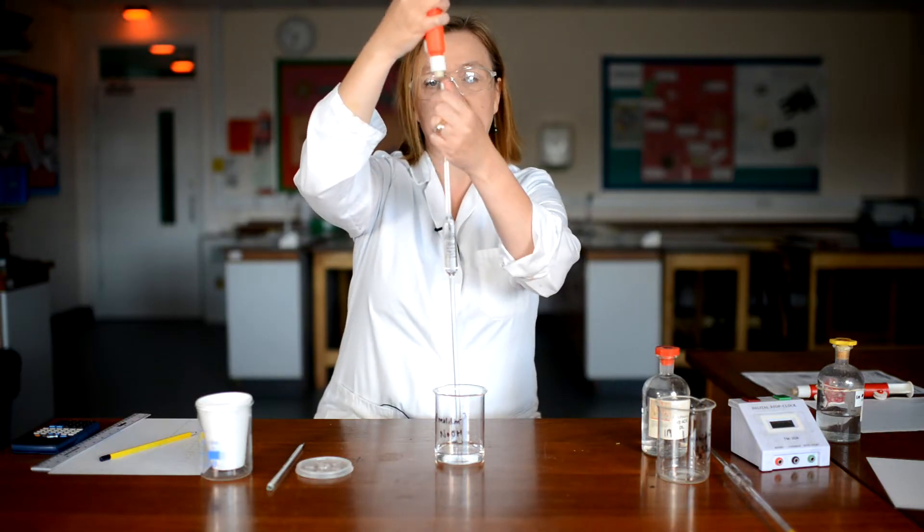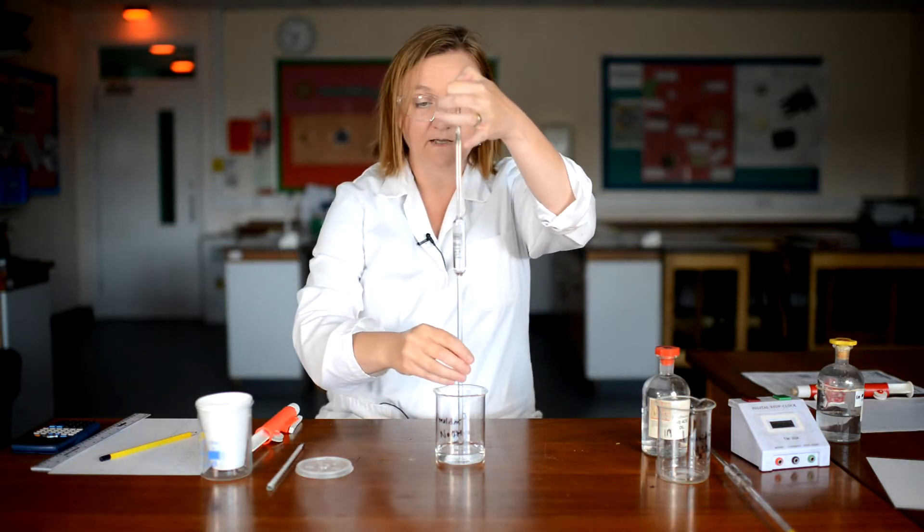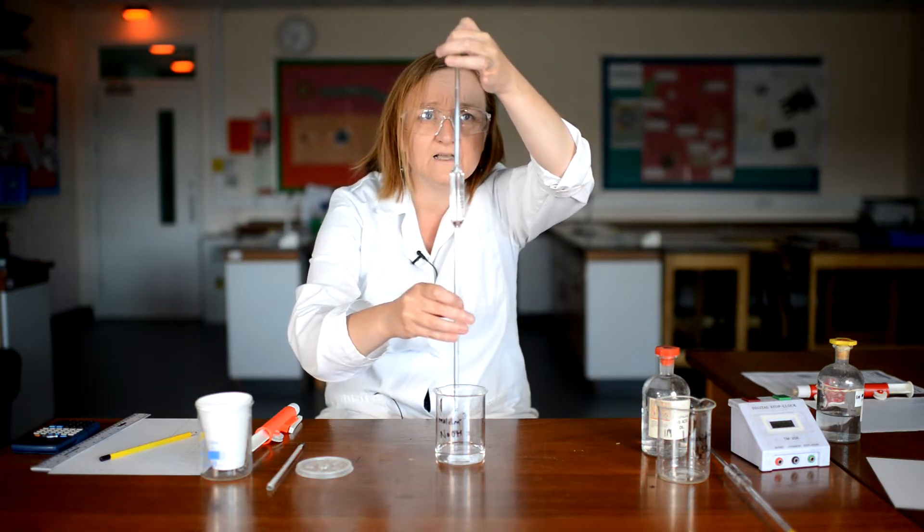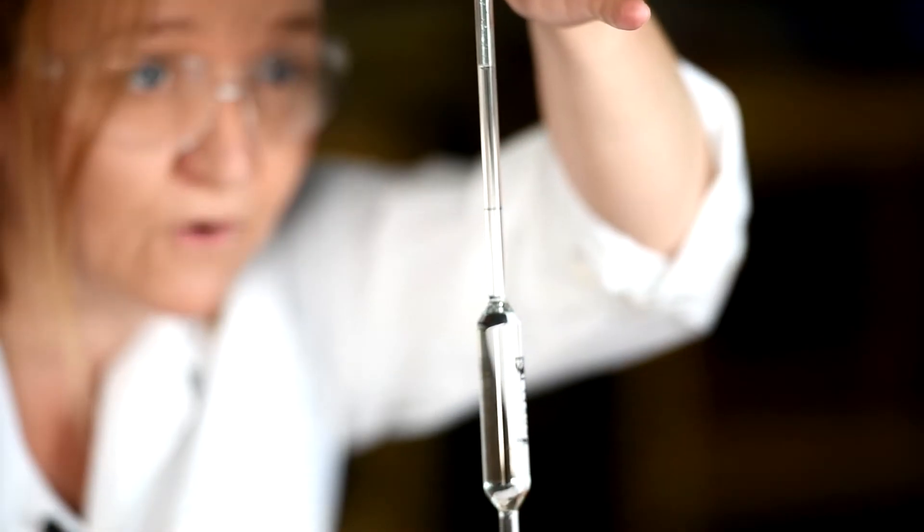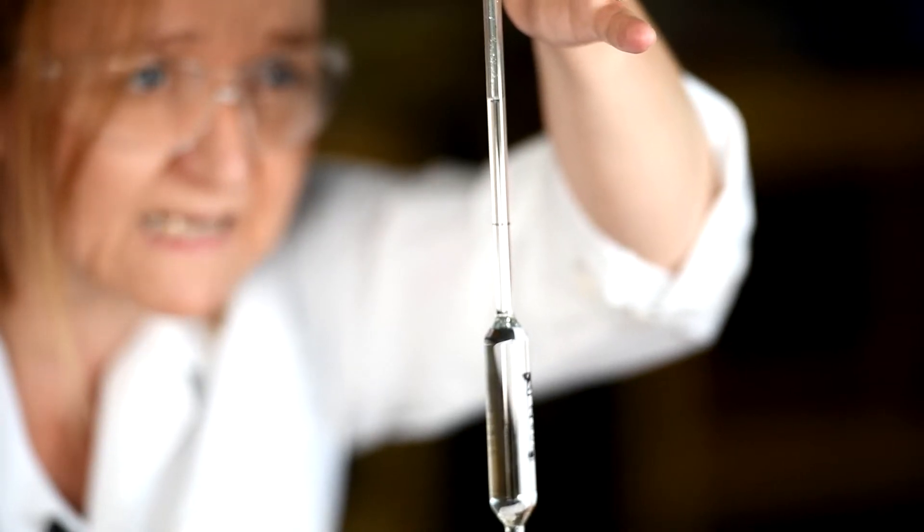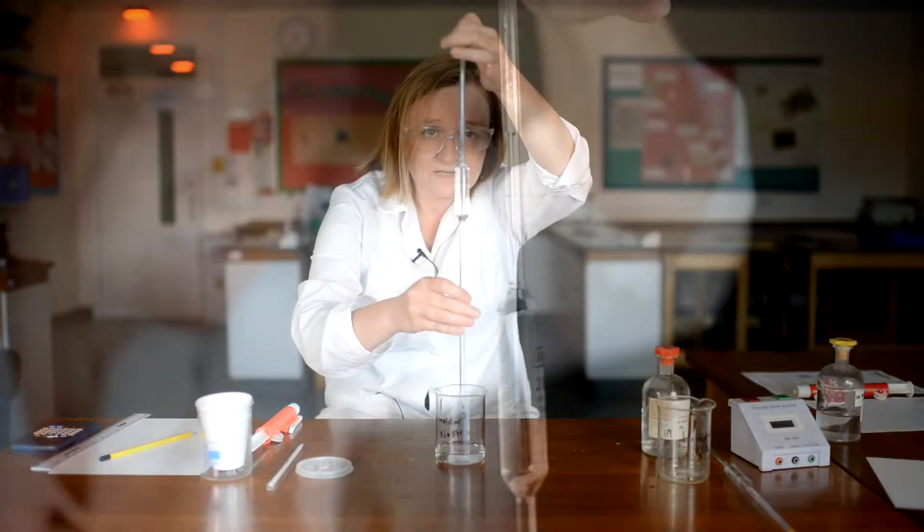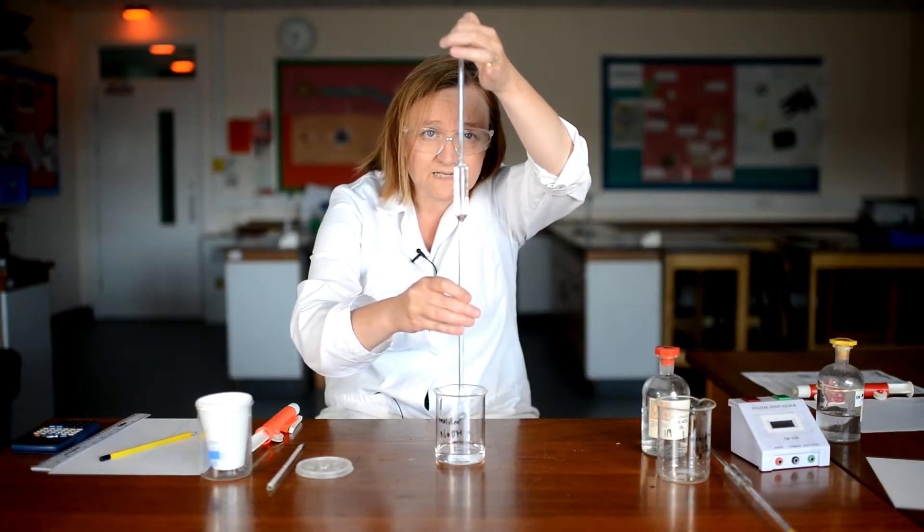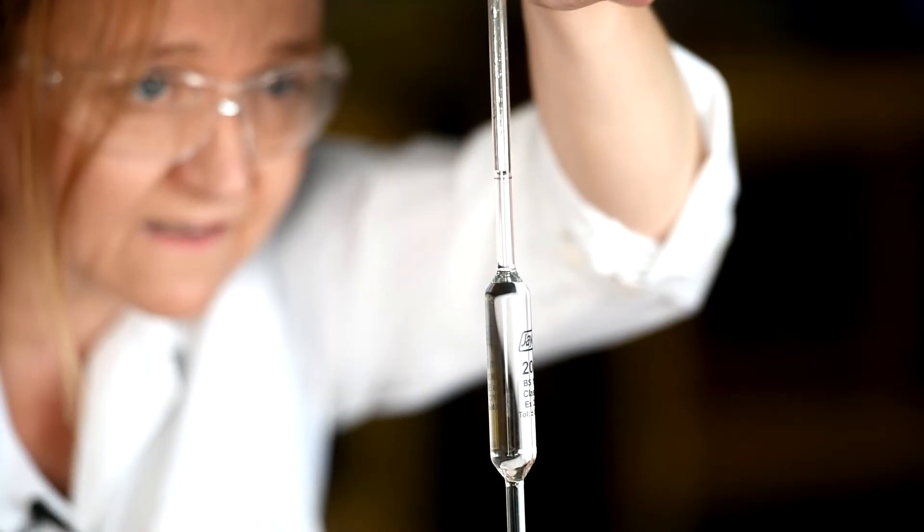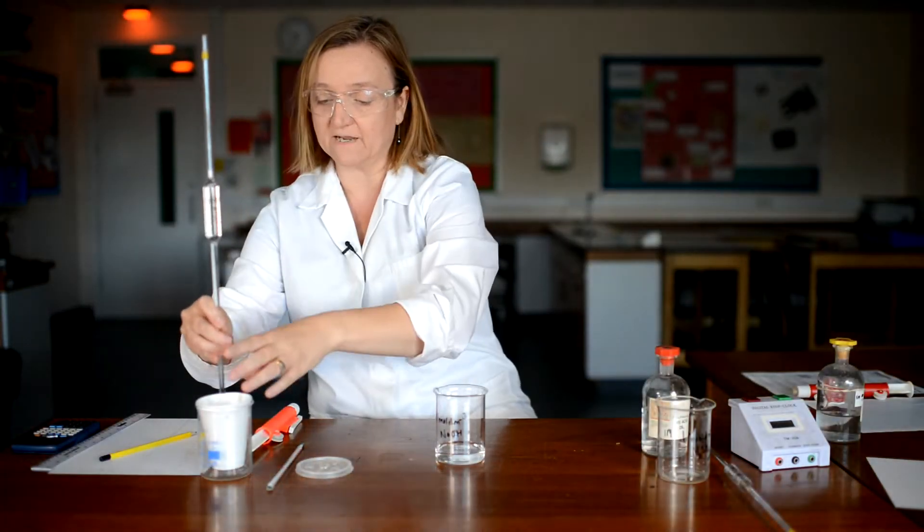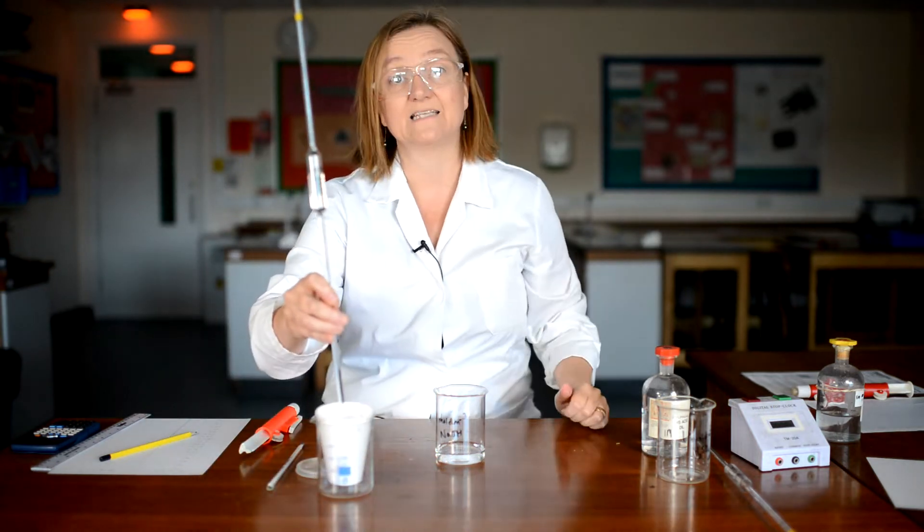I can then take that off, put my thumb on and then looking at eye level, I'm just going to twist gently so that the level in the pipette drops. We've got a really clear meniscus and I want to bring it down so the bottom of the meniscus is just sitting on the line like that. And then I'm going to transfer that into my cup and let it drain in.